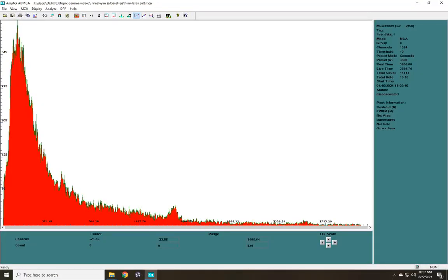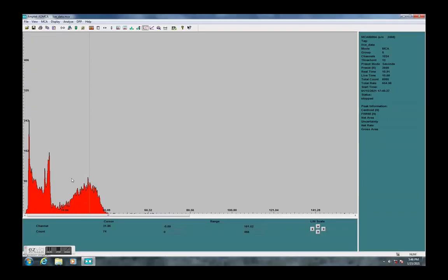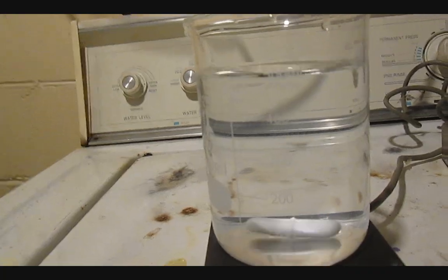Because of the potassium I checked its natural radioactivity and verified it was not above background level. Next I used the XRF to make sure it did not have any heavy metals, and it looked like it might contain traces of cesium. These two peaks over here are just the lead from the shielding. So I'm not sure why anybody would believe standing in a room where salt is being gently heated would purify the air or improve your health in any way. But I've seen worse scams, and this looks to me to be a greed-driven repurpose of a product.